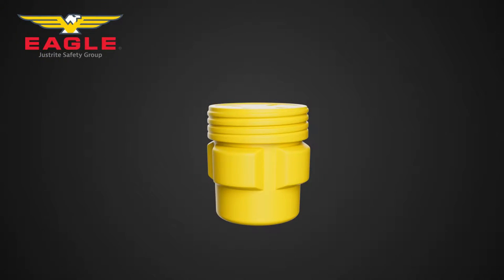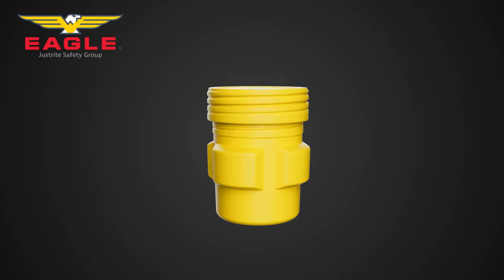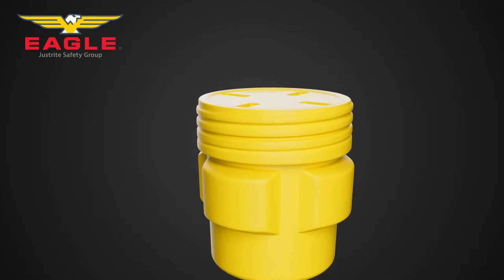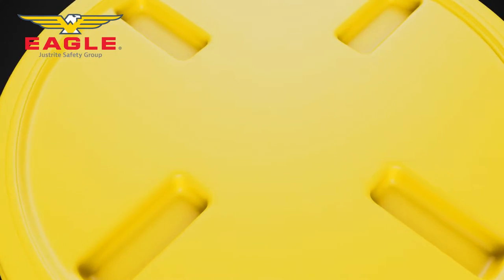Our overpack and lab pack poly drums are made of high density polyethylene, meaning they are lightweight yet durable and long lasting. They have resistance to environmental stress cracks, corrosion, a wide range of chemicals, and abrasions, and feature UV inhibitors to protect the contents of the drum from sun exposure.